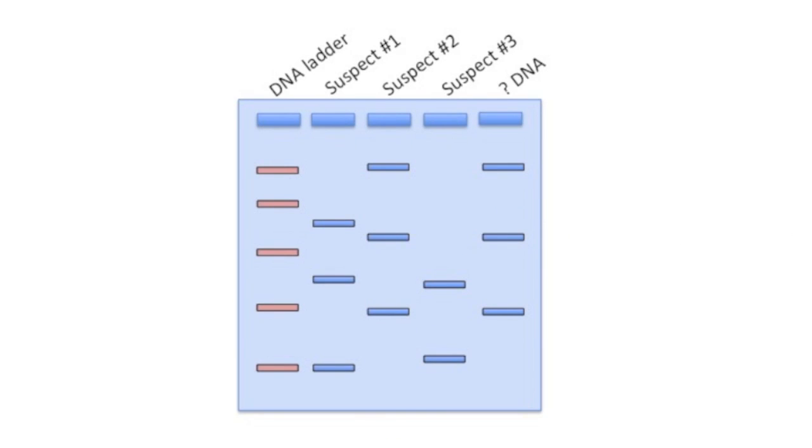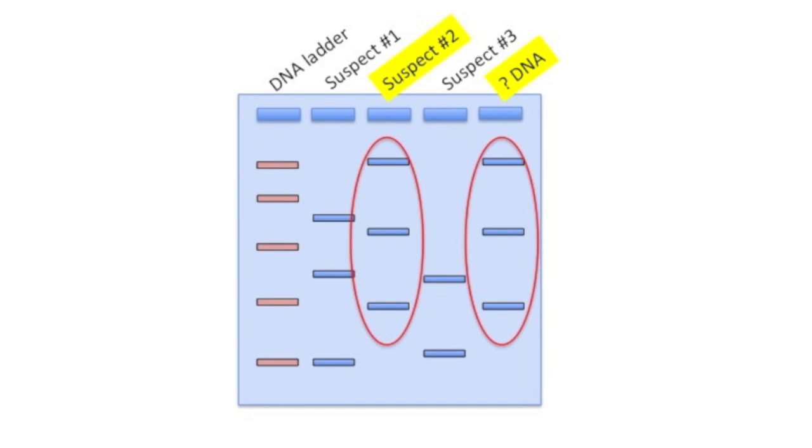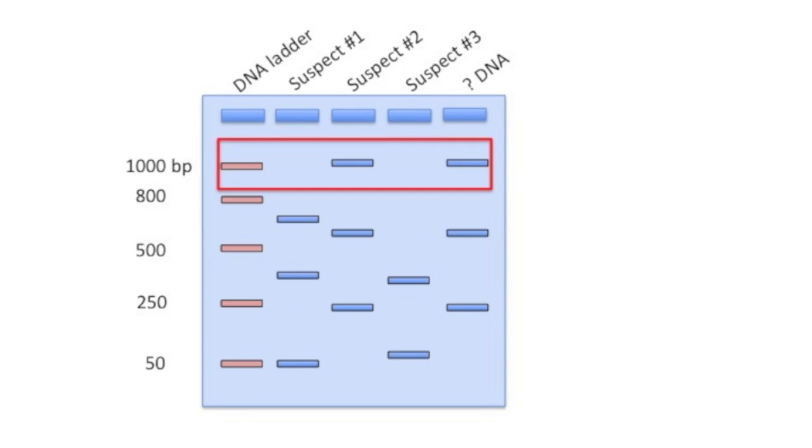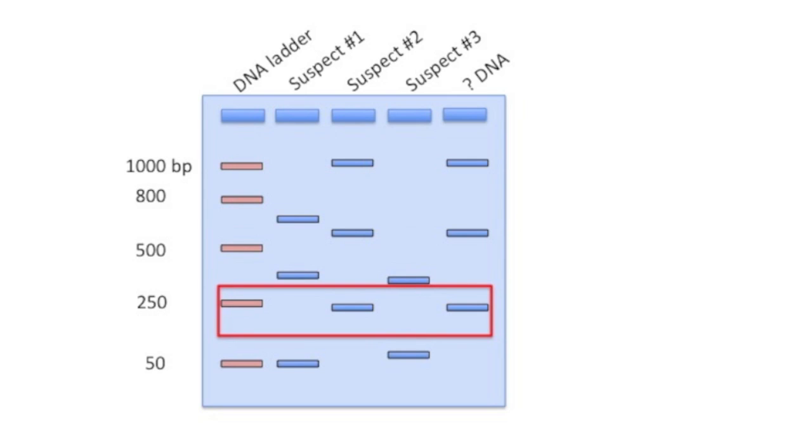What else can we tell from the gel results? Well, remember how we said earlier that the ladder can be used to figure out the size of an unknown fragment of DNA? Let's try to do just that with suspect 2's DNA. The first fragment is at the very top of the gel and lines up with the 1,000 base pair ladder marker, so we know that that fragment is around 1,000 base pairs long. The second fragment is trickier because it doesn't line up perfectly with the ladder marker, so we need to estimate the size. Since it's between the 500 and 800 base pair markers, but closer to the 500 one, we'll say that it's approximately 550 base pairs. In the same way, we can determine that the size of the last fragment is approximately 225 base pairs long.